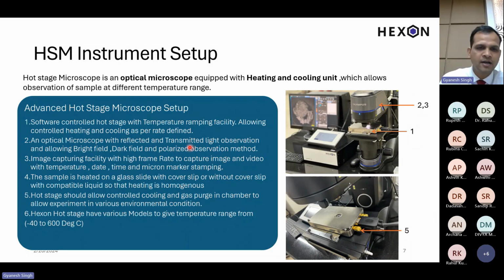A crystalline particle will have bonded chains, so it will start giving a birefringence pattern, which is very useful data when we want to understand whether a particle, after melting or in cooling, in whatever phase it is, is crystalline or amorphous. So this is point number 2.